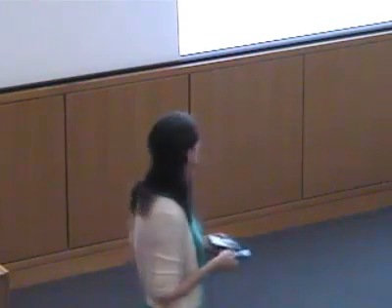One thing that is also a theme in my talk is that we can understand these simple models, but we also have to be aware that there are going to be exceptions to these rules, and we want to do our best to understand those exceptions. What I'm showing here are those same data for 6-coordinate and 5-coordinate iron complexes, compared to an iron model that is also 6-coordinate, but has a chelating nitrate that distorts the local geometry.